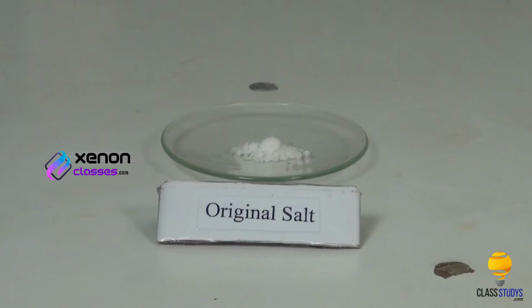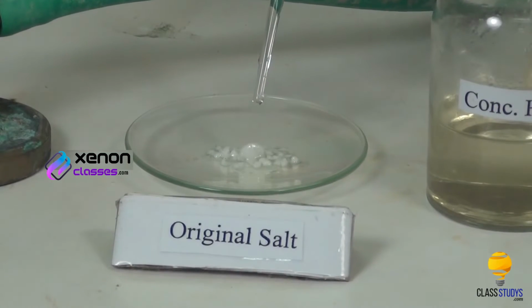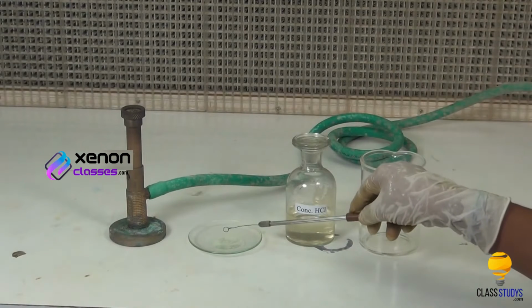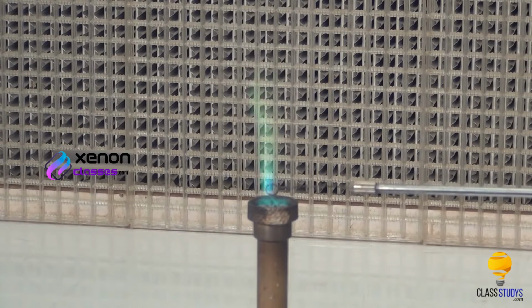Procedure: take a small quantity of the salt in a watch glass. To this, add a few drops of concentrated hydrochloric acid using a dropper. Mix the contents of the watch glass using a glass rod to make a paste. Take a small amount of the paste on the platinum wire loop and introduce it into the oxidizing flame of the Bunsen burner. Green flashes indicate the presence of zinc ion.